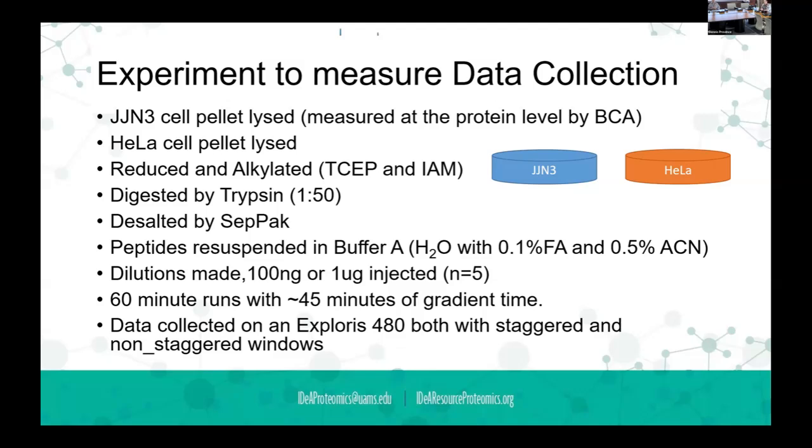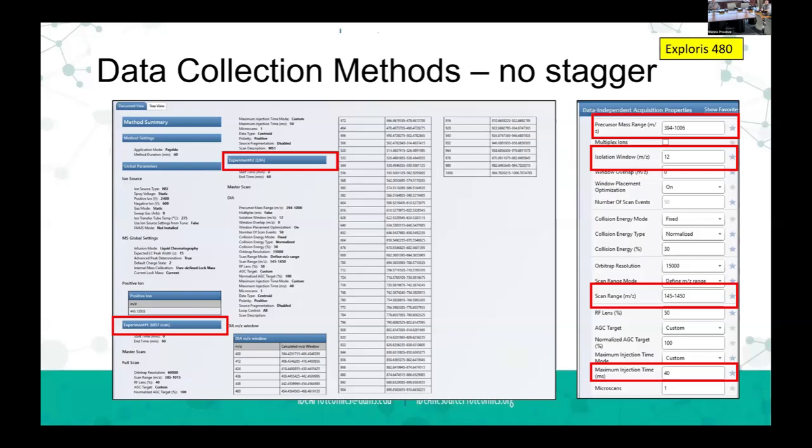And then I measured these. So one of the first questions I wanted to know is, because Aaron Story had started DIA here, and he had these staggered windows, and some people do non-staggered windows or don't do that. And so I wanted to know, is there a difference?